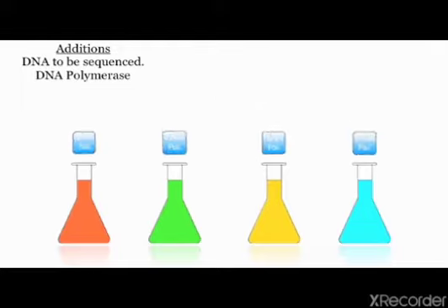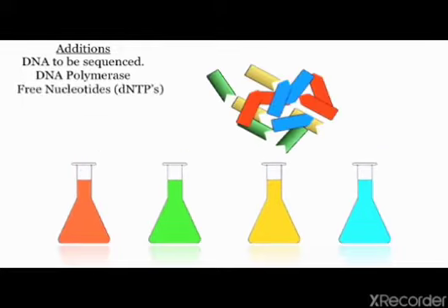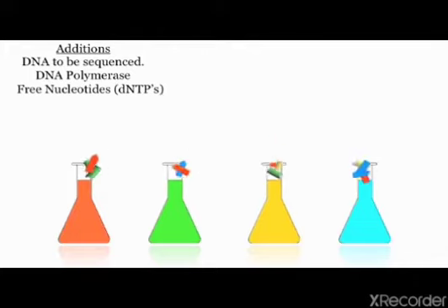This is followed by the addition of DNA polymerase. Free nucleotides, or dNTPs, are then added to the reaction mixtures. One of these dNTPs is usually radiolabeled with a phosphorus-32 or sulfur-35 atom. This helps in determining the DNA sequence later.